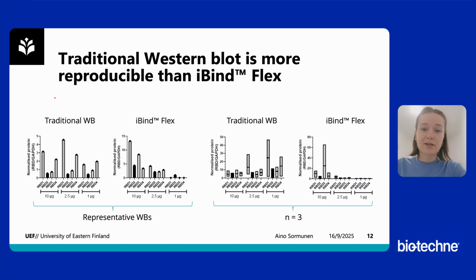And this is most likely because of the lack of reliable detection of either RBD or GAPDH at the lower concentrations. However, we have previously used other antibodies that have performed well with iBind, so it is definitely antibody dependent, and this highlights the need to optimize all antibodies.